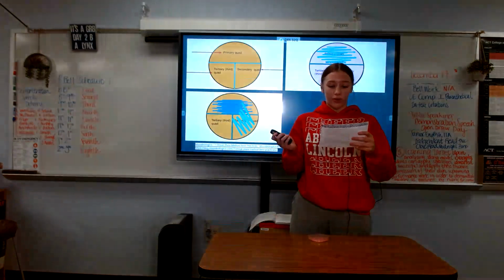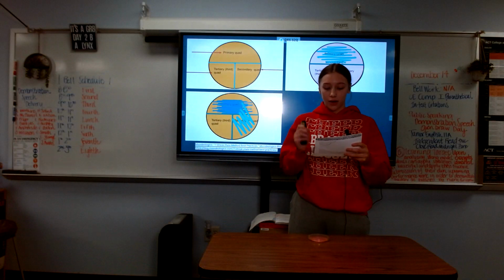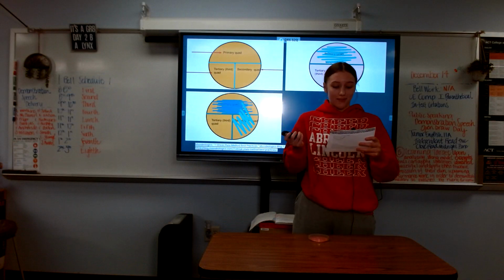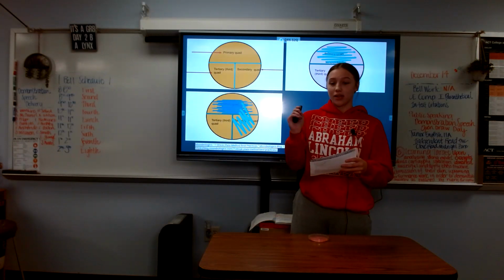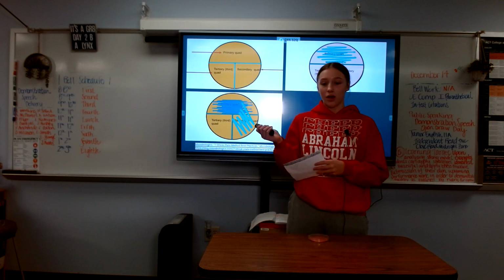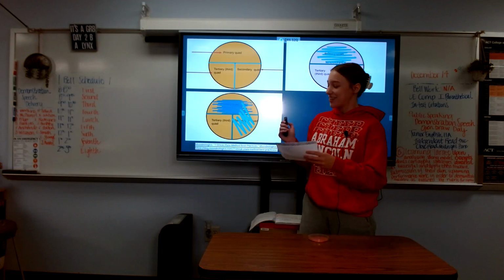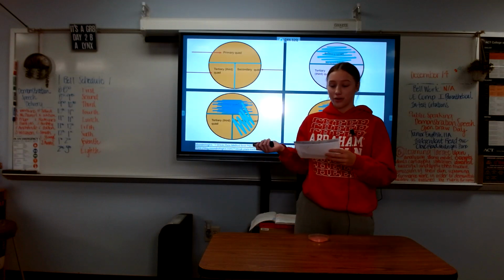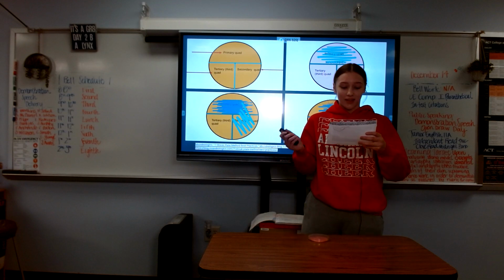And then, according to microbiologics.com, you need to sterilize your inoculating loop between each quadrant, and you'll do so with the rest while doing the third and second quadrant. So then, doing your second quadrant, you will go diagonal, making sure that you do not go into the previous quadrant more than 3 times. And then you will do the same for your third. And now you are done.